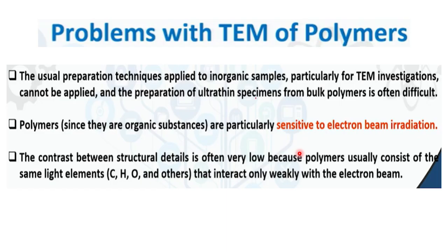For example, if someone is working on metallurgy, it is very important for them to go for the TEM to observe the defects. If someone is working on doping, of course through TEM they can visualize whether crystal plane or lattice disorientation is happening or not. You can visualize it through the HRTEM image. That much resolution is possible.